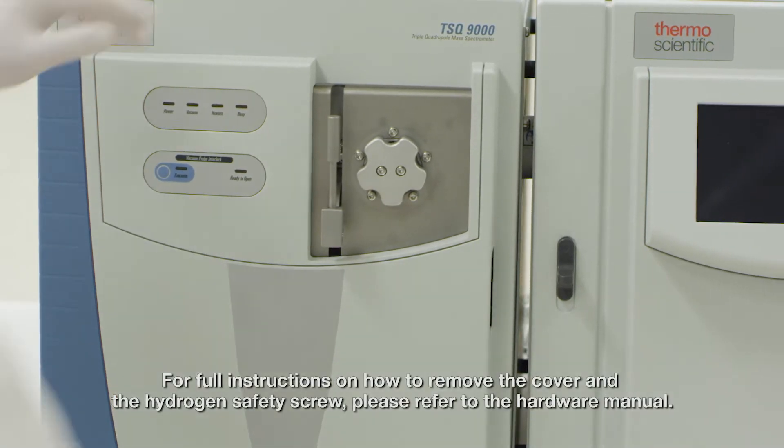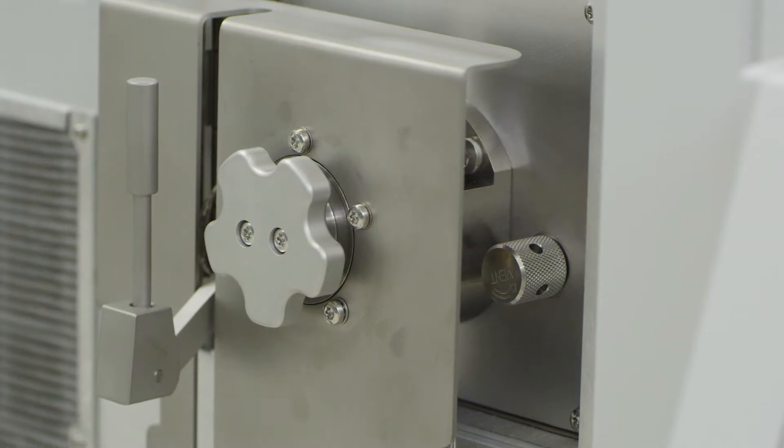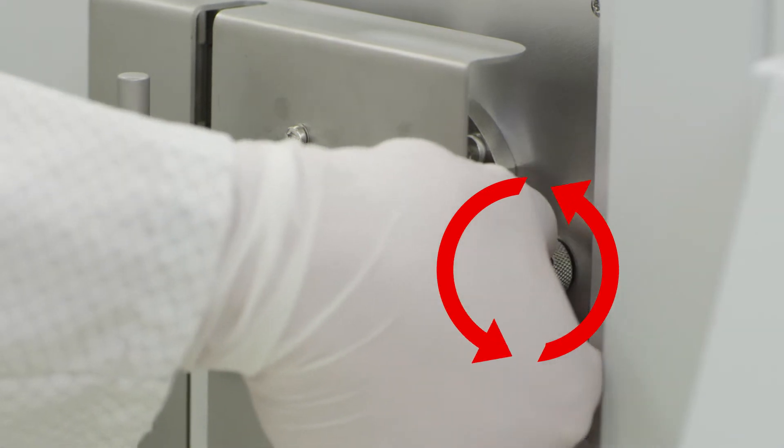Open the front cover to access the manifold. Behind the manifold cover, locate and open the manual vent to relieve the pressure of the vacuum.